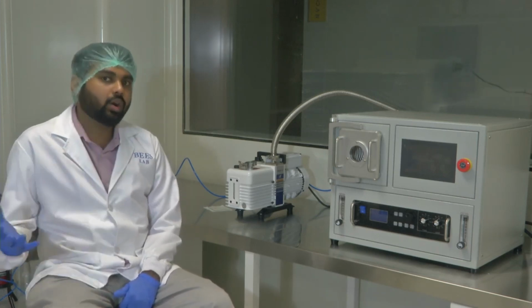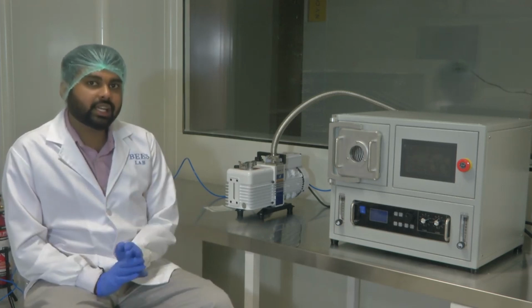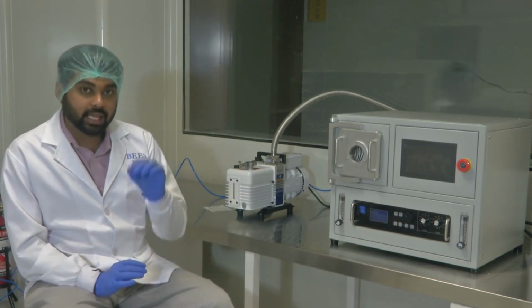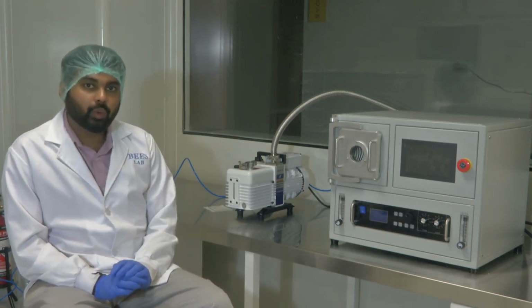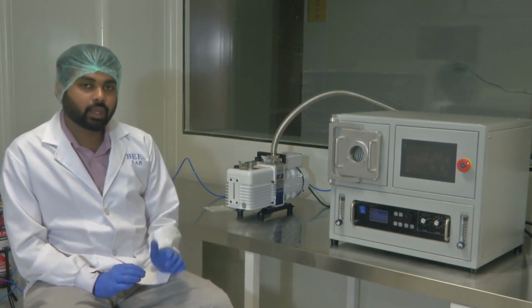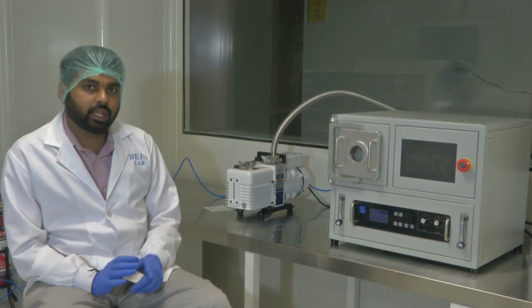First we take out all the air that is there in the chamber. So that is the baseline. We create vacuum. Once we create the vacuum, we let in our gas species for which we are going to create plasma. In this case, it is oxygen. So we create a sufficiently large vacuum using the vacuum pump here. Once the vacuum is of satisfactory level, you let in oxygen into the chamber.